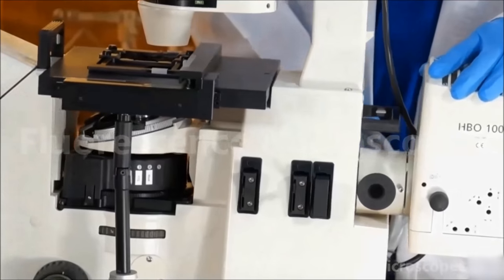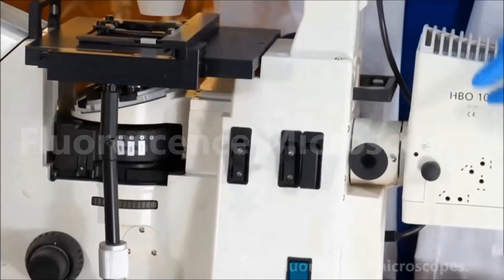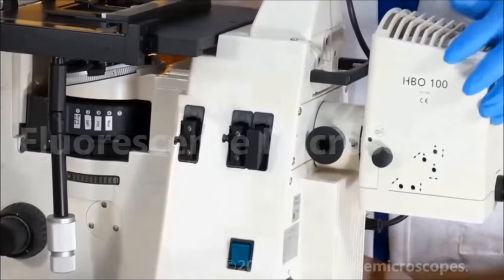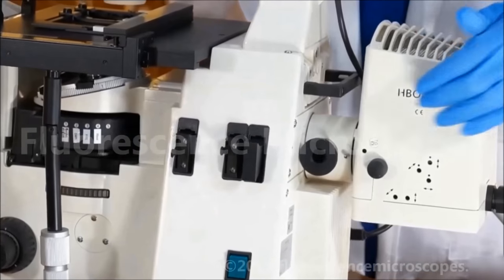On the back we have a viewing aid. This is used to center your bulb and your HBO lamp housing.